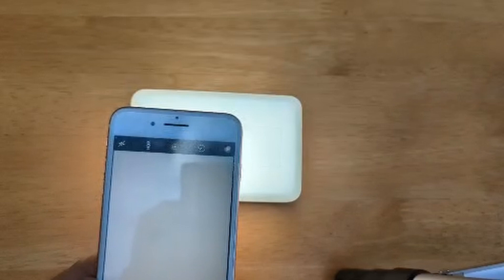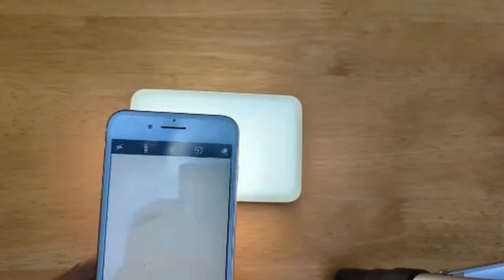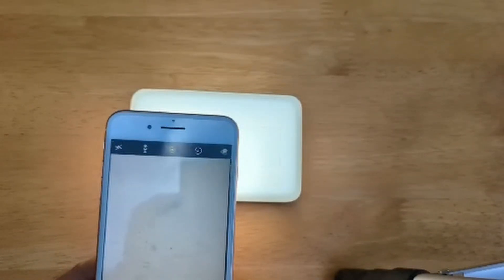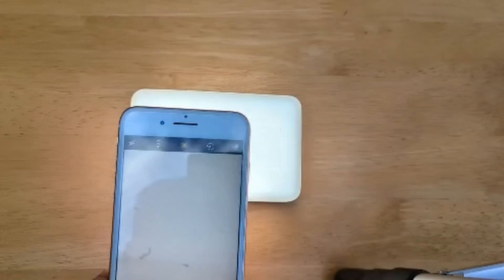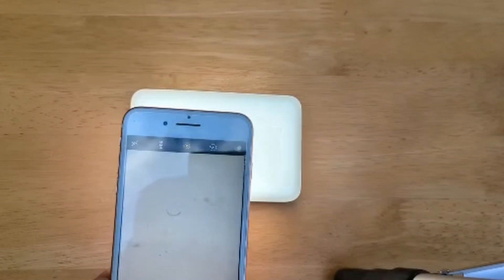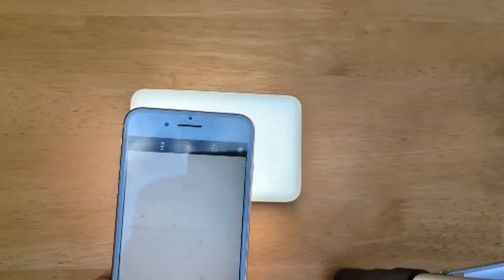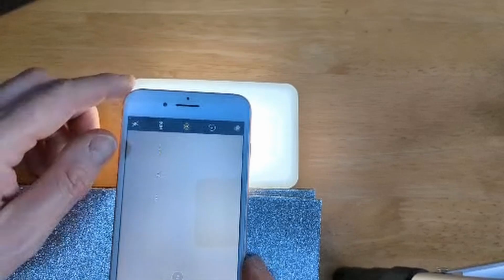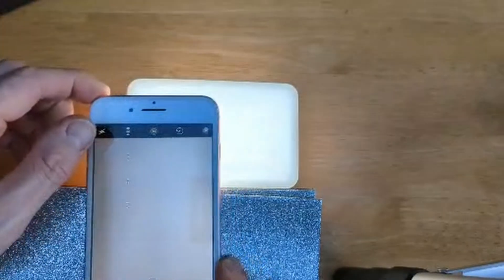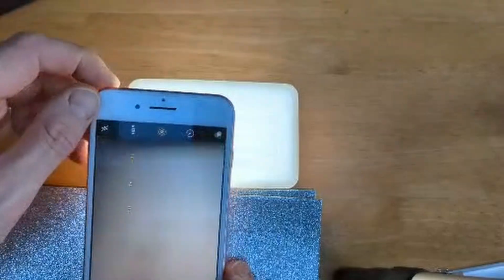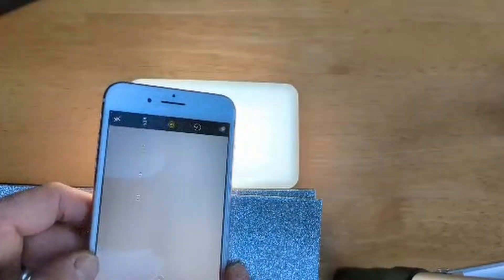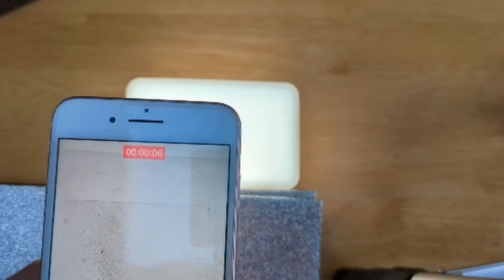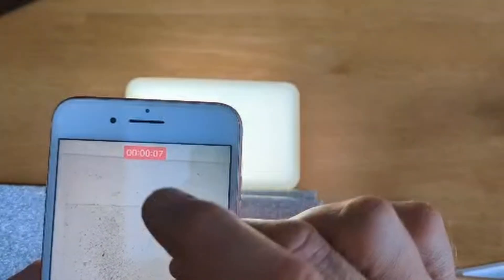It was a bit fiddly at first. You really need a steady hand for this or to build some kind of staging. I built my staging out of a load of placemats because it allowed me to adjust the height to exactly where I wanted it.